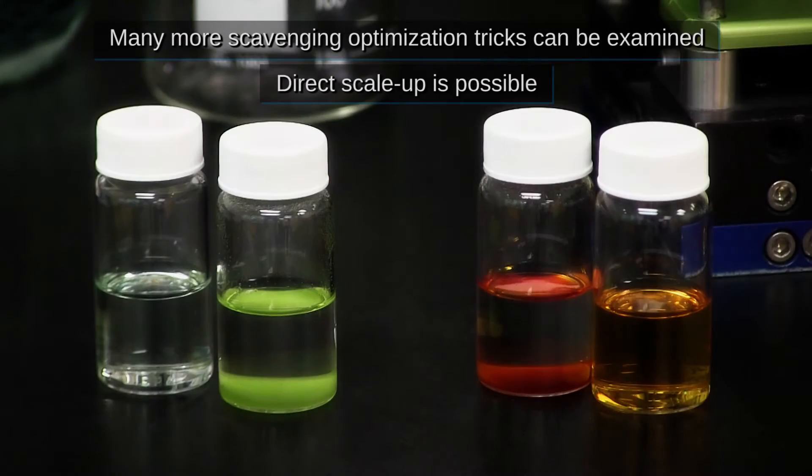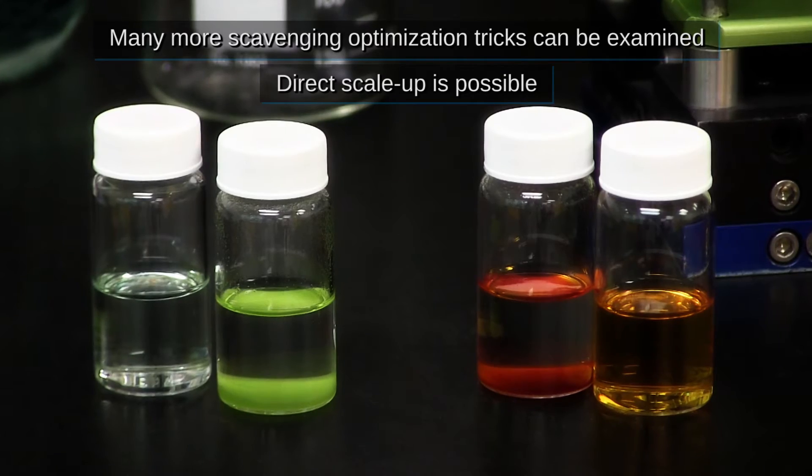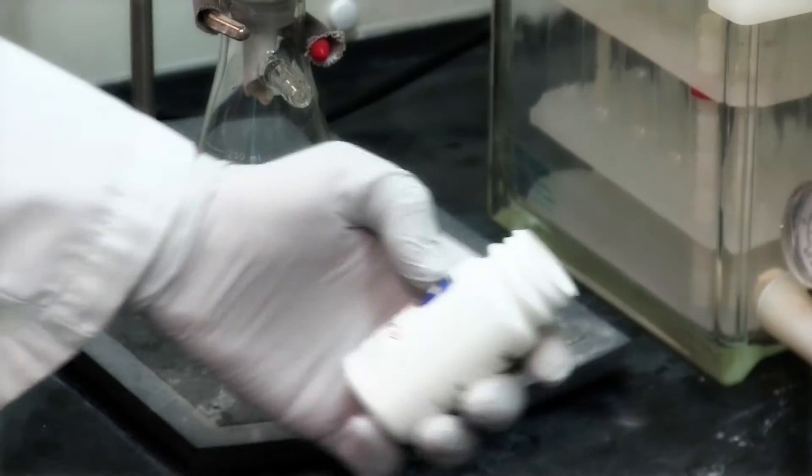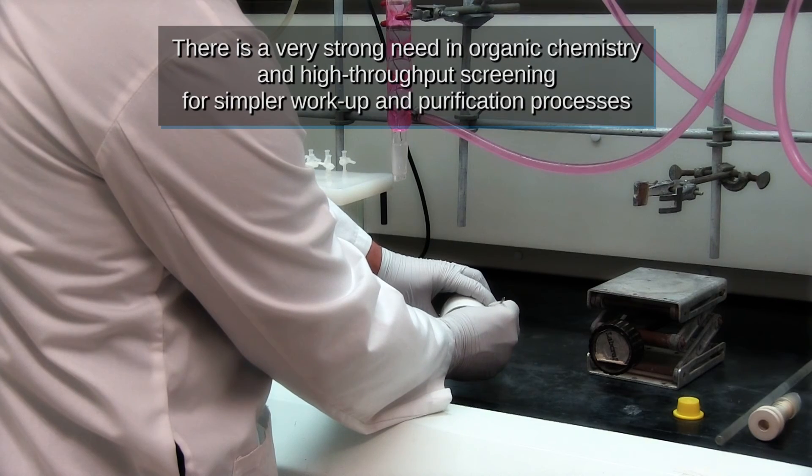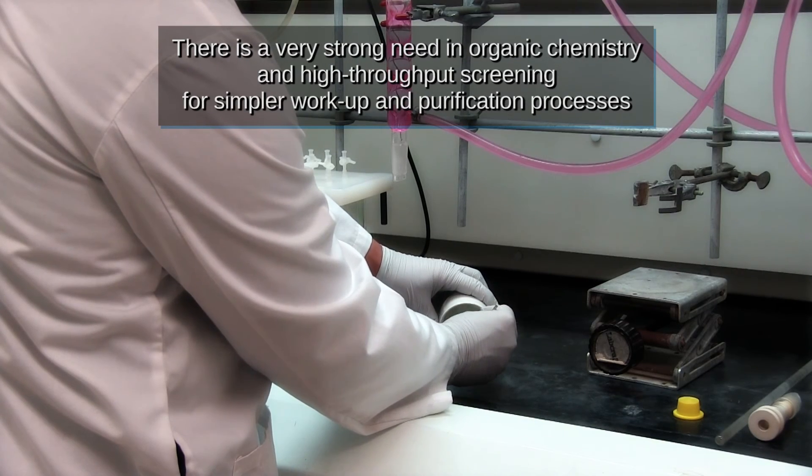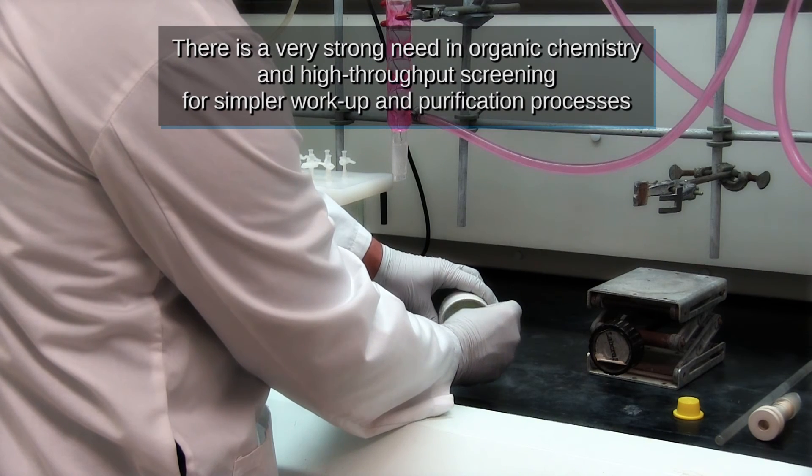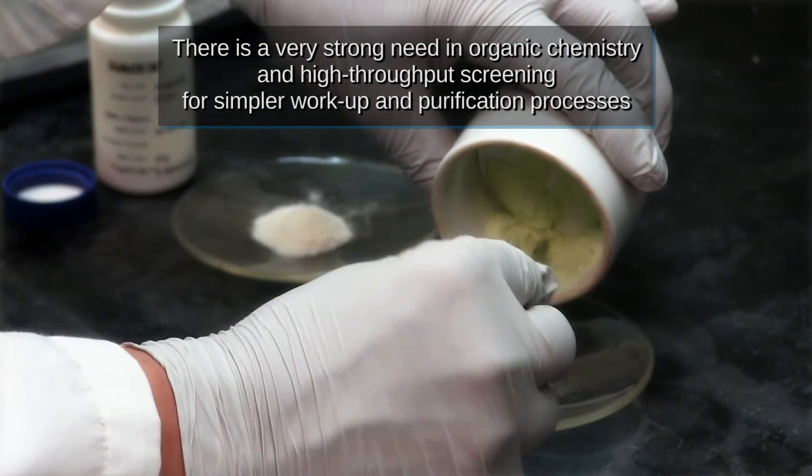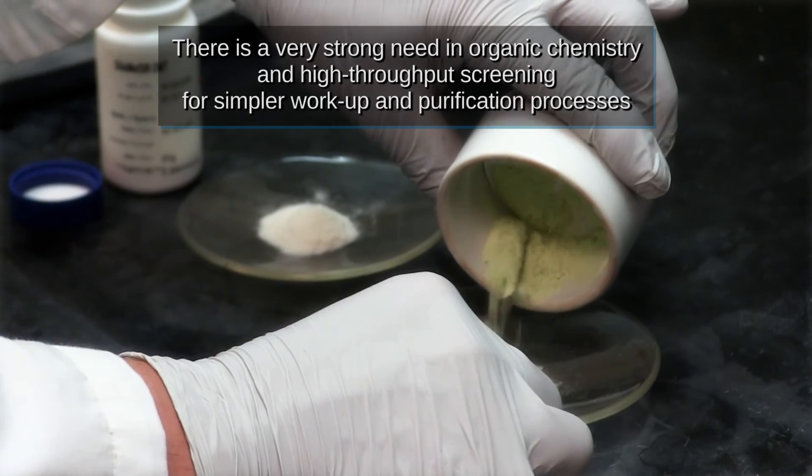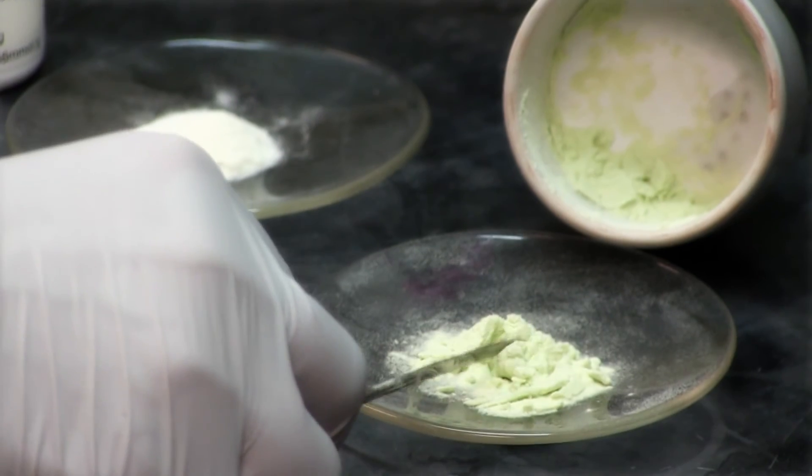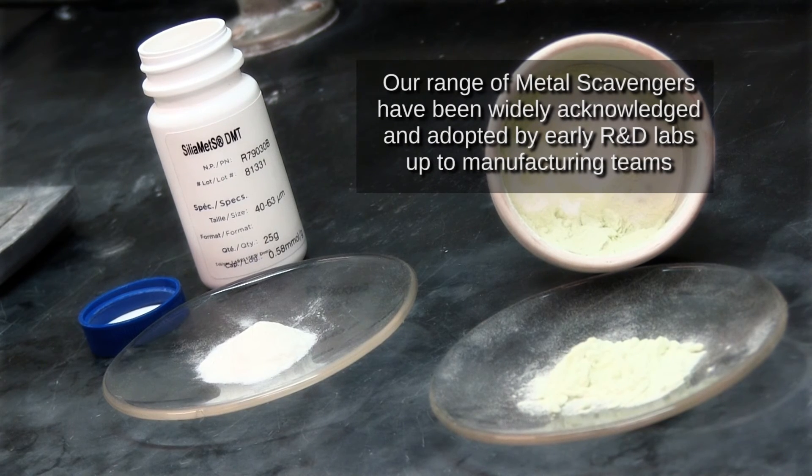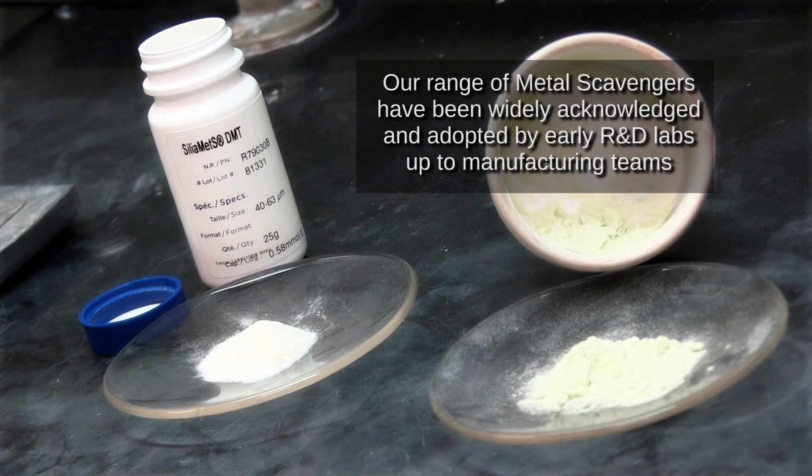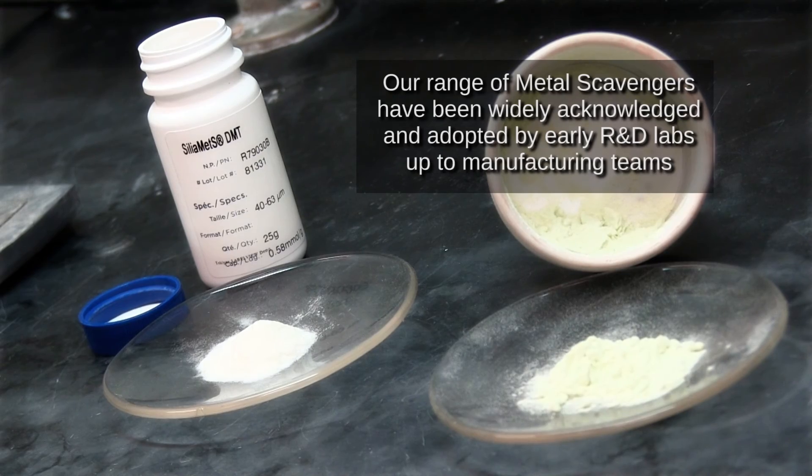Many more scavenging optimization tricks can be examined. Direct scale-up is also possible. There is a very strong need in organic chemistry and high throughput screenings for simpler work-up and purification processes. Our range of metal scavengers have been widely acknowledged and adopted by early R&D labs up to manufacturing teams.